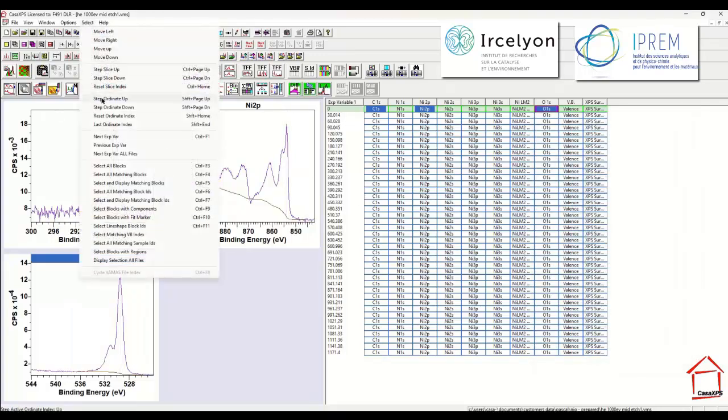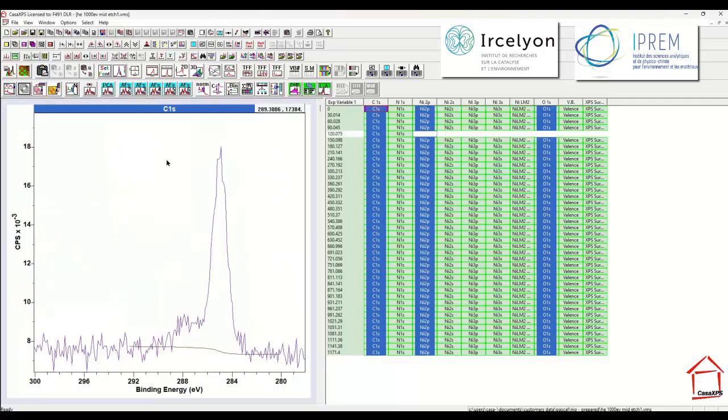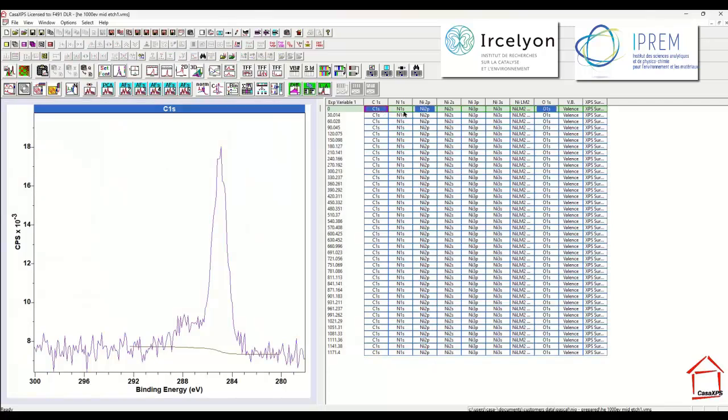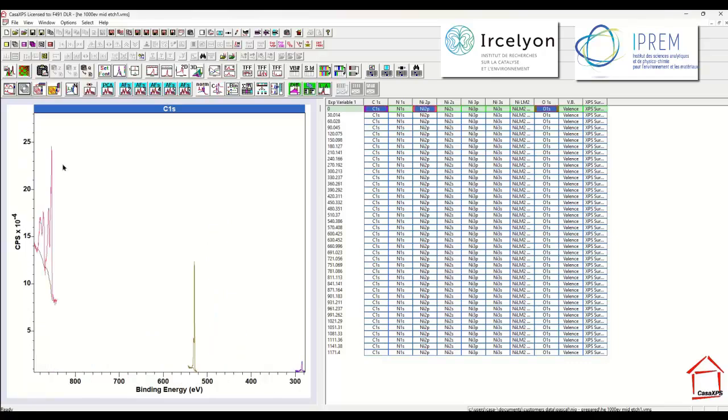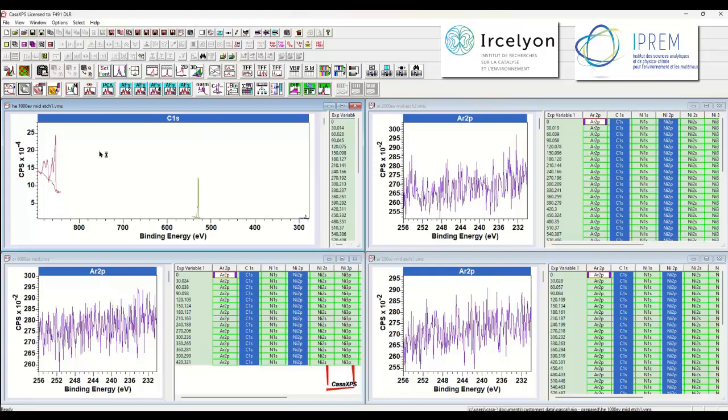I make the selection I'm interested in performing the transfer. That's a mistake, because what I want to do is arrange these data in such a way that I can then propagate from these regions to all the other files. And in order to do that, I need to arrange in the active tile the three different VAMAS blocks with regions defined. Then I can make the selection. So in each one of these files I now have a selection. I have the three spectra with regions defined in a state that when I make a selection of this particular display tile with the three spectra overlaid, then I can apply the propagate and match.